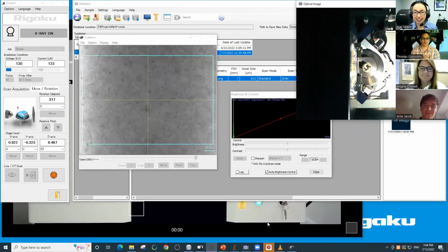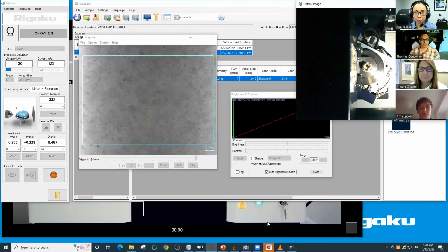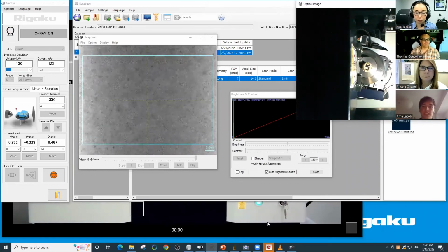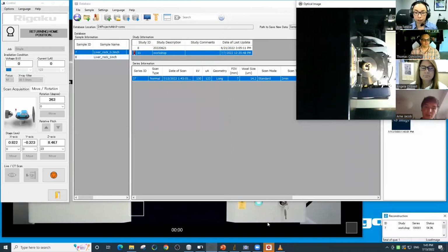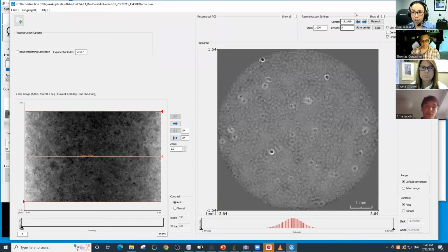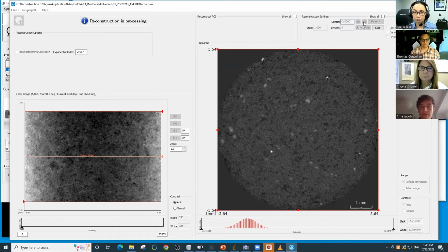Yes, okay, I can go ahead. So of course, if you adjust the range of your scan, you will get down from 16-bit to 8-bit, which means that you do not have those 65,000 values in your histogram range, but you will compress that image and also the information which is inside of your images to the new range of only 0 to 256. And of course, then you will lose information, and that might make your image processing much harder than with a 16-bit dataset.